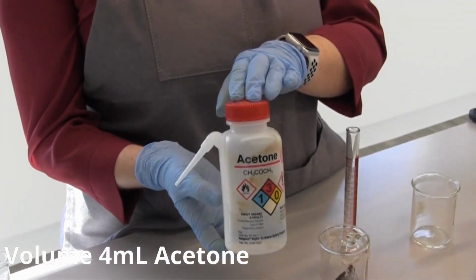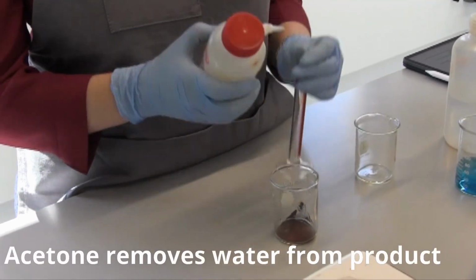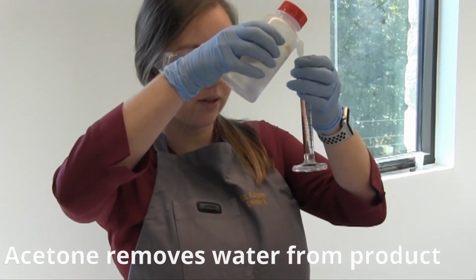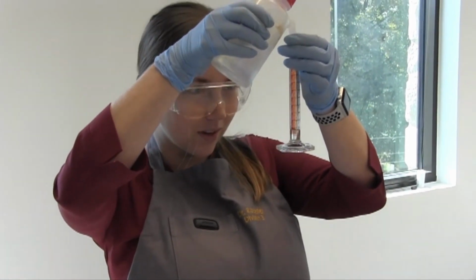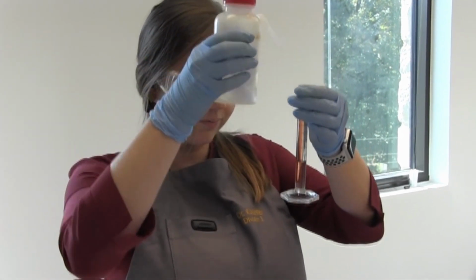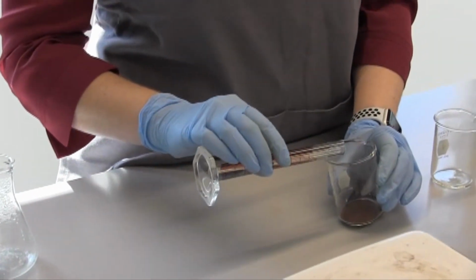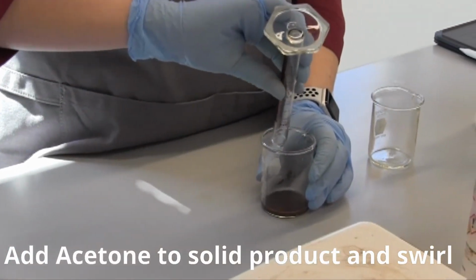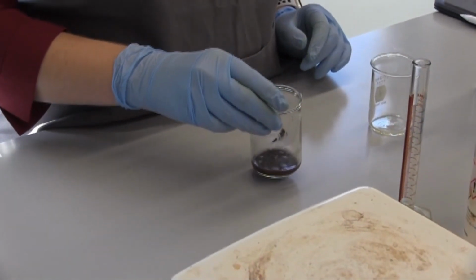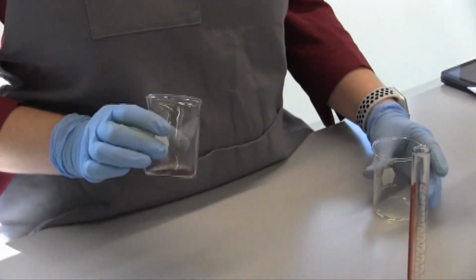Now add several milliliters of acetone to the copper. The acetone washes are important because acetone readily dissolves the water and can remove it from your solid. Swirl and allow to stand for a few moments and then decant off the acetone.